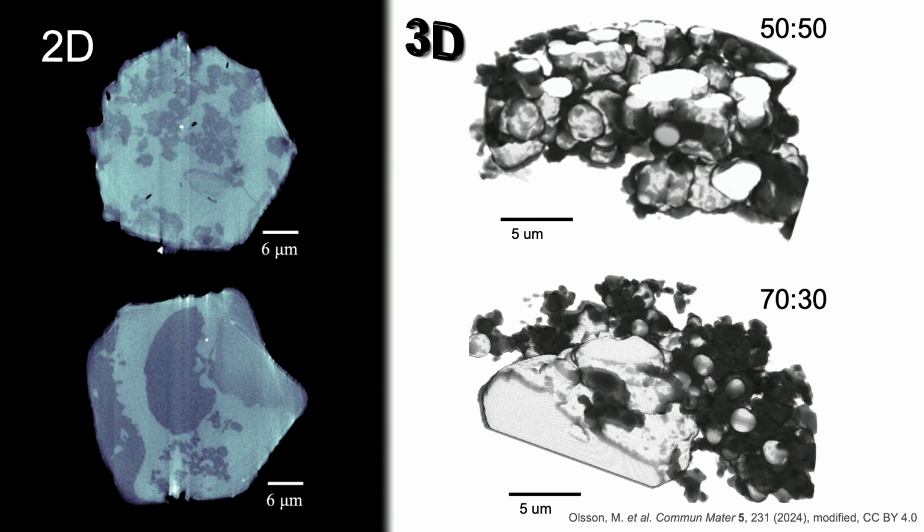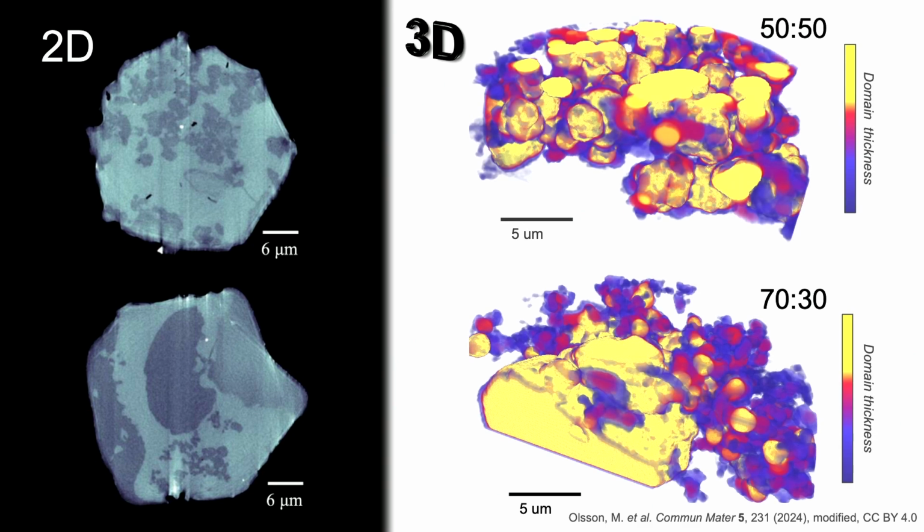In these images, we have segmented out the hydrophilic phase, and the volume renderings show a cross-section of the image volume of the samples. As this phase will be dissolved when digested, we can get a better understanding of how the drug diffuses and also relate it to the drug release properties.